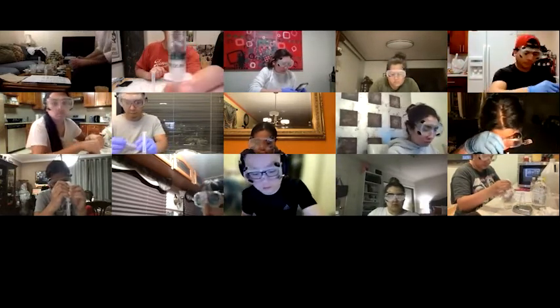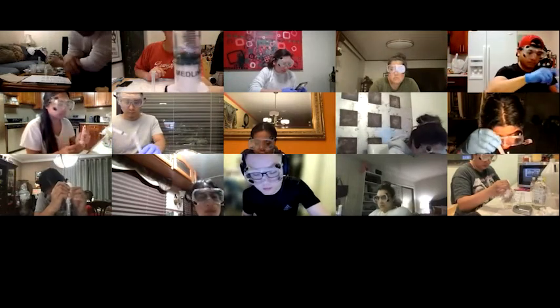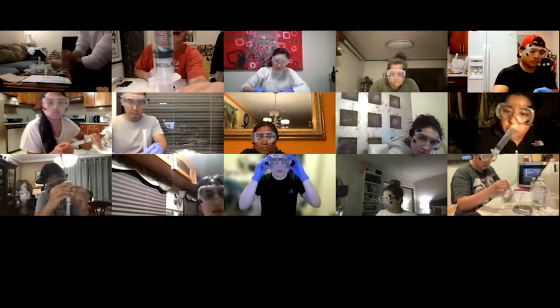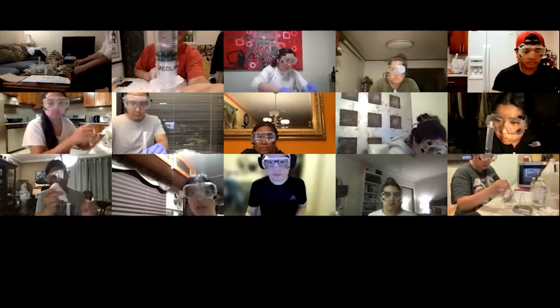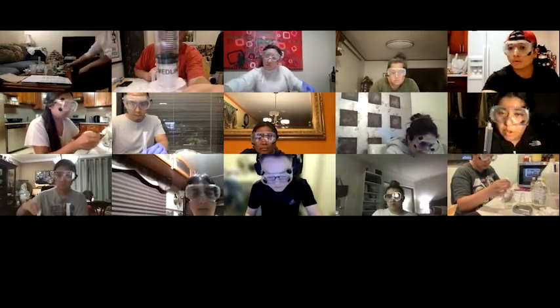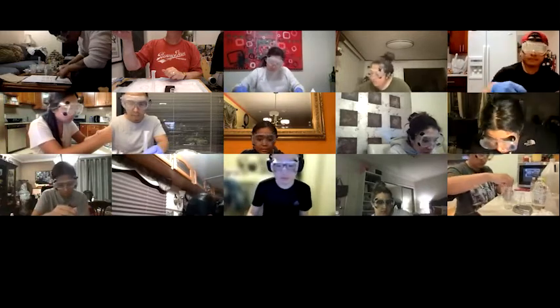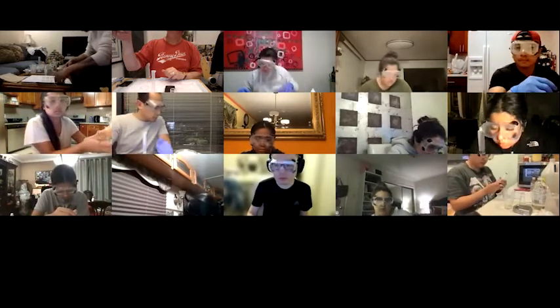So the volume is going to be the top of the syringe. Okay, that's going to be your initial volume. So the top of the syringe, not the bottom. So that top ring, that's going to be your initial volume. So my initial volume is, well, that's actually right on 10. So 10 mils.